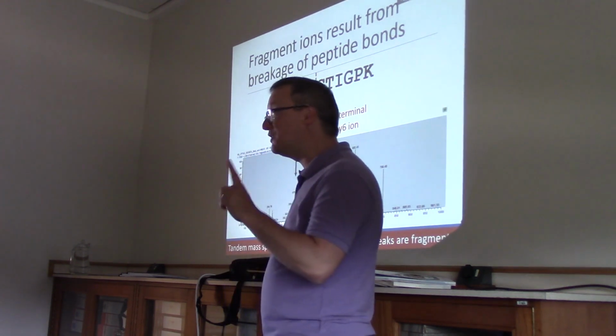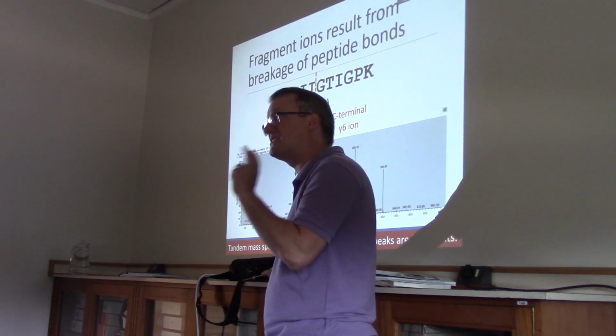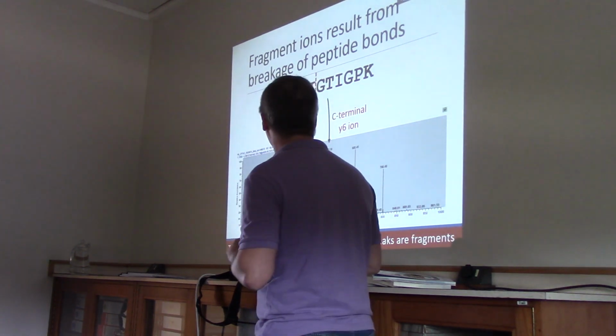Now, some of the most popular amino acids that we find in structures are isoleucine and leucine. And they're a complex case for proteomics because they have the same mass at 113. All right, so now we have a few numbers to kind of guide us in understanding this.